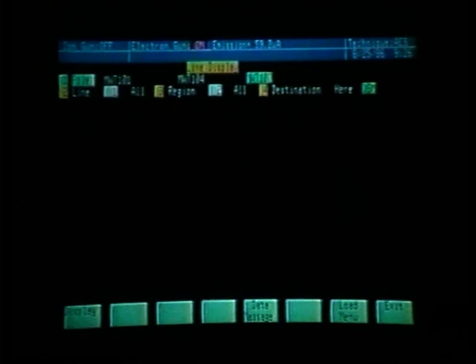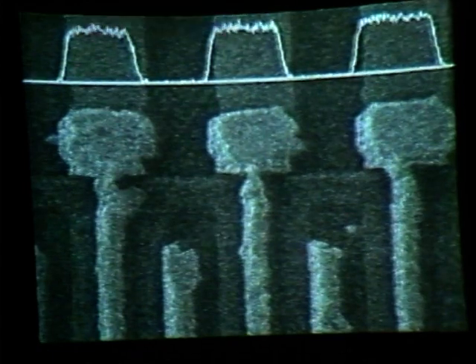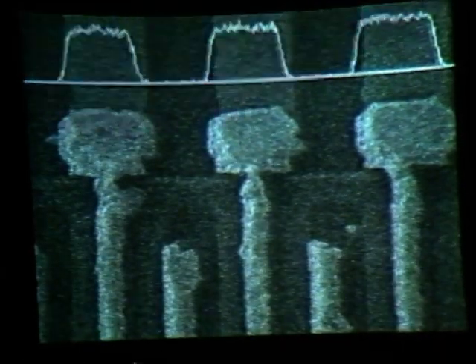Returning then to the TV monitor, we can ask to display soft key number 1, and we will see superimposed on our SEM map the tantalum line scan and the baseline line number 1.